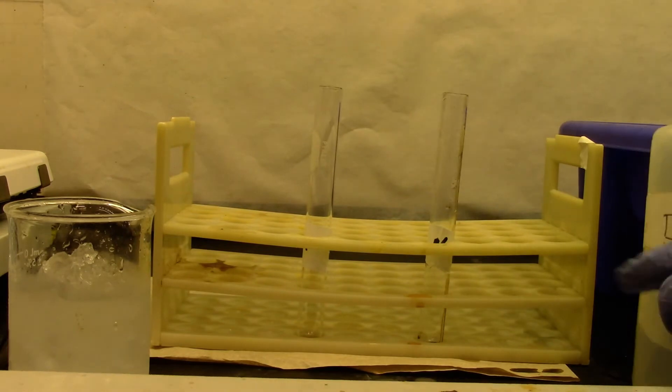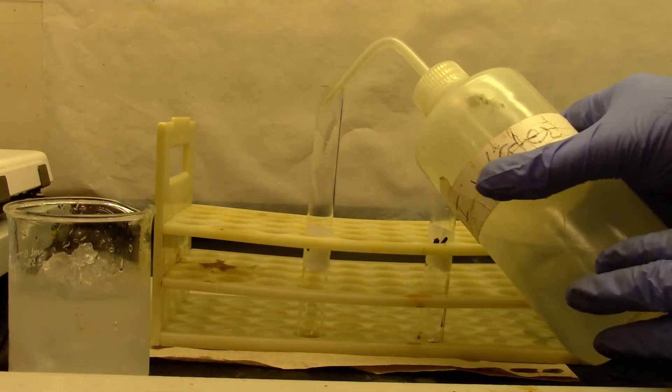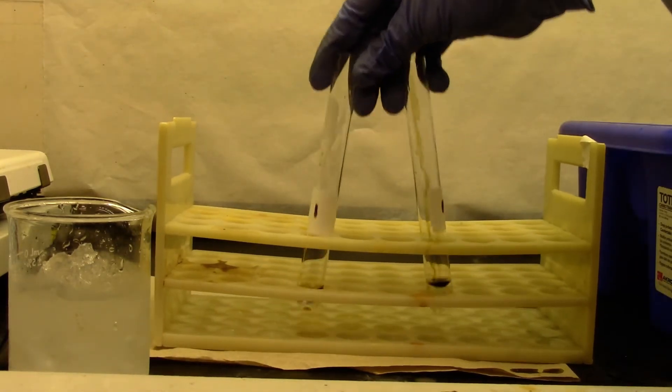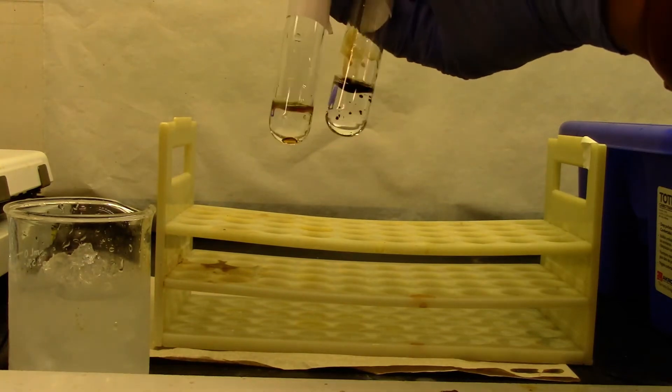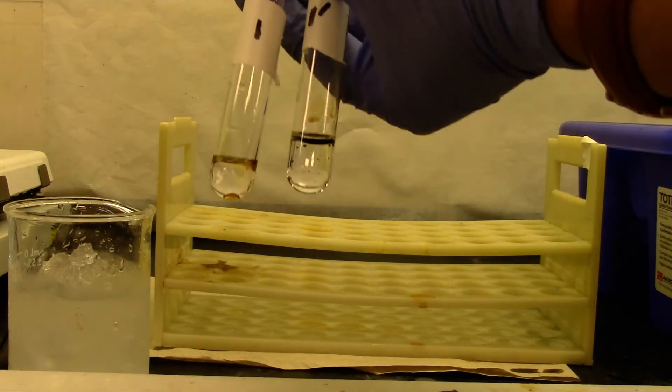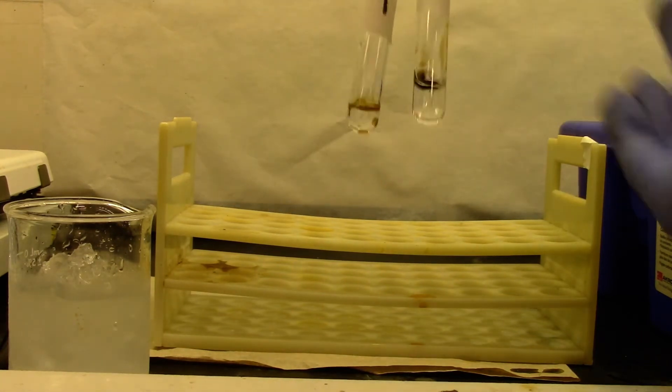We will approximately add 2 mL of DI water in each. If you can see, this is how they look like. It is an oily layer floating in water. I am going to add 8 drops of concentrated sulfuric acid in each of these samples.